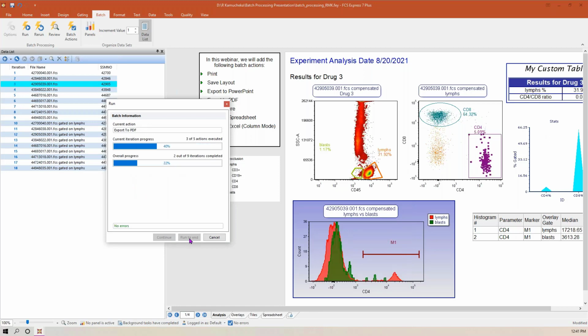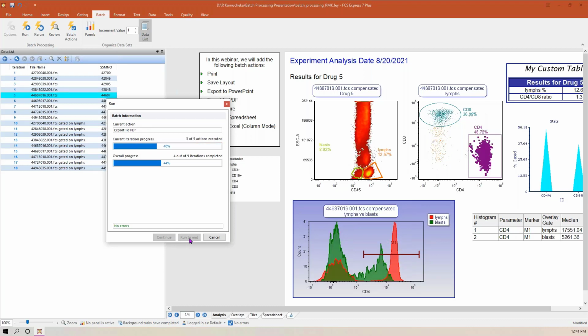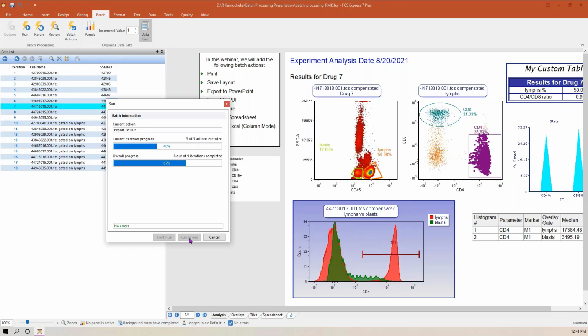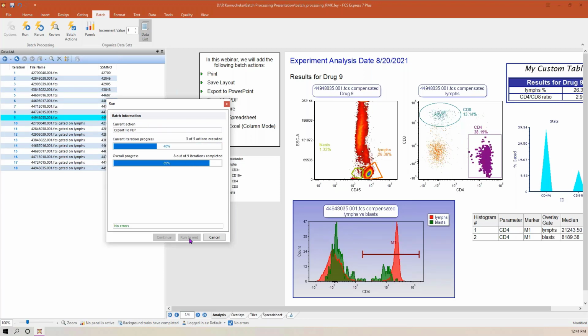And it moves really quickly. It's going to produce all of these different elements. So it's producing 5 different things as I'm running this. We've got that PowerPoint, we have the PDF, we have an internal and external spreadsheet, and then we're also doing that save for my layout.